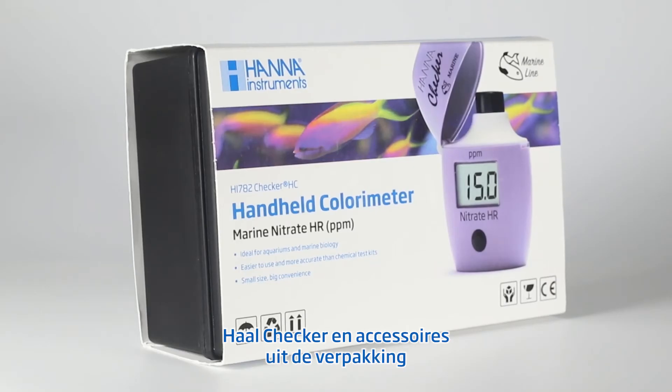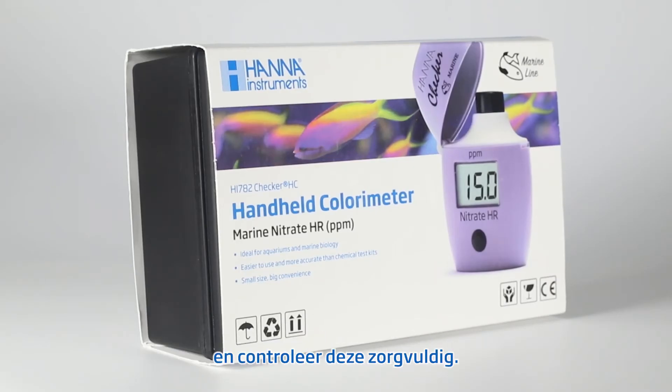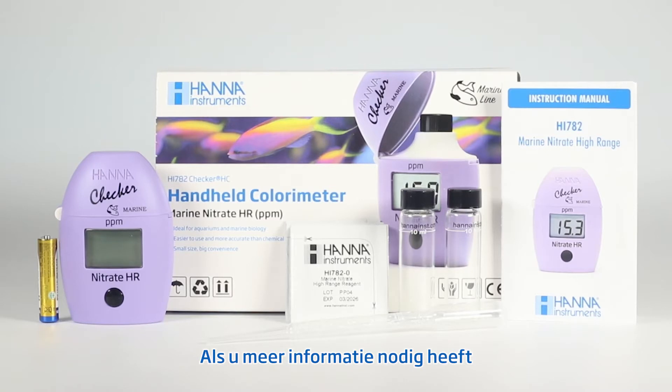Remove the checker and accessories from the packing material and carefully examine it. If you require any further information, please contact Hanna Instruments Technical Support Team.